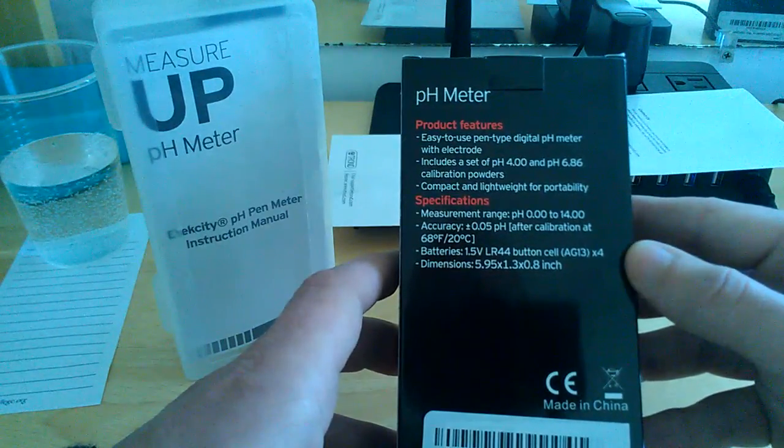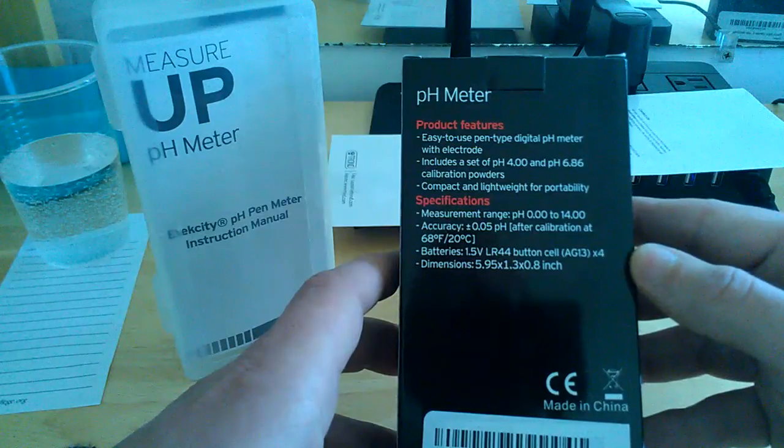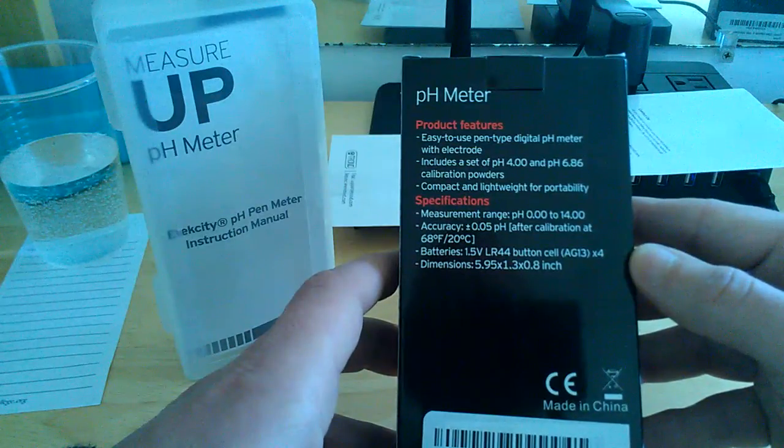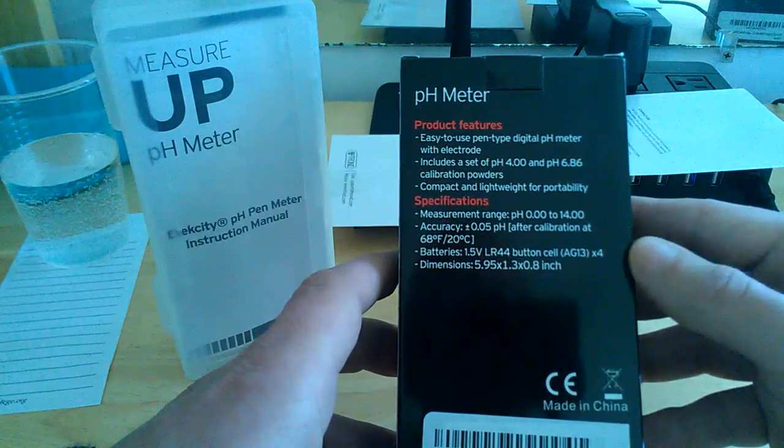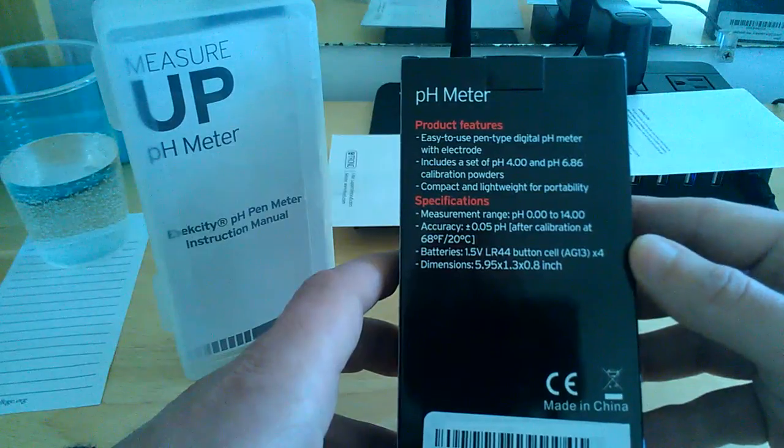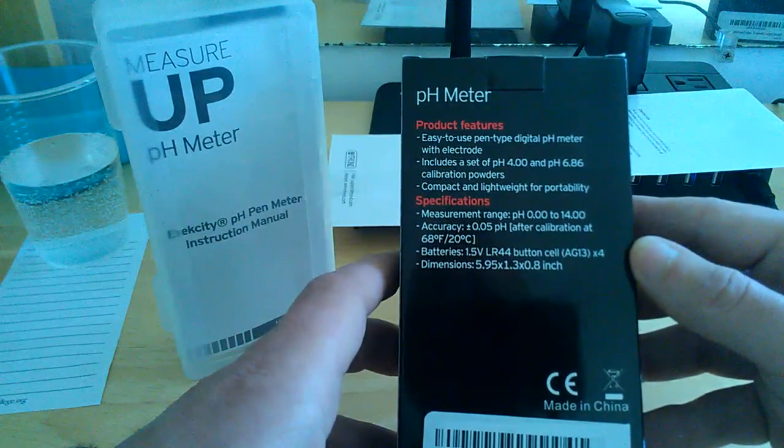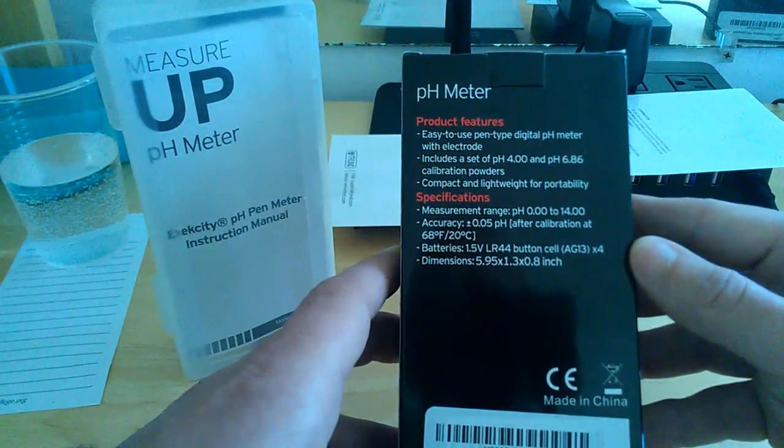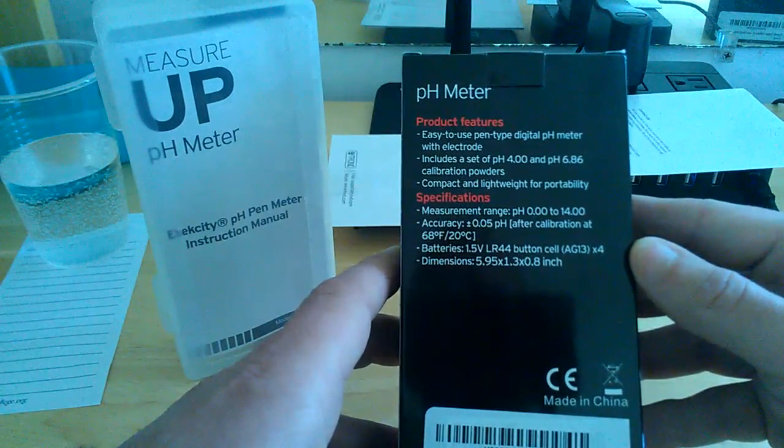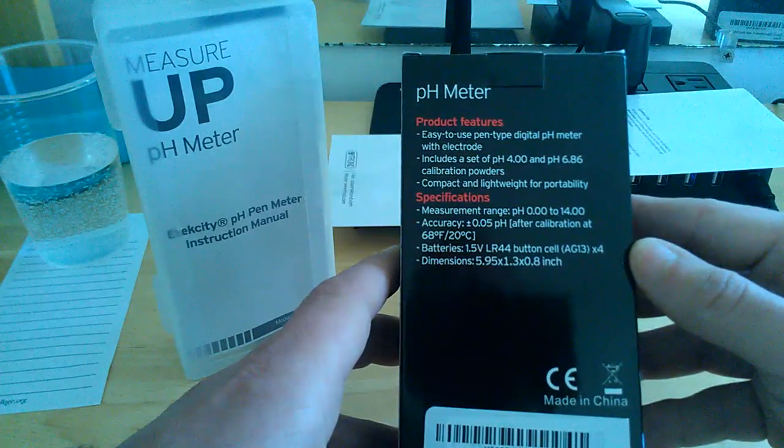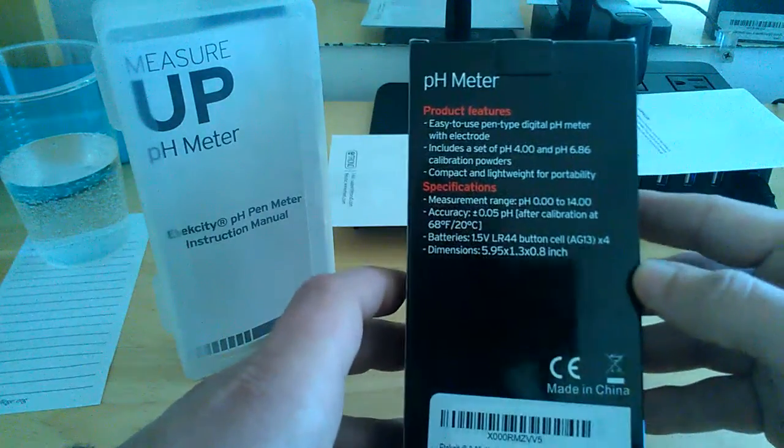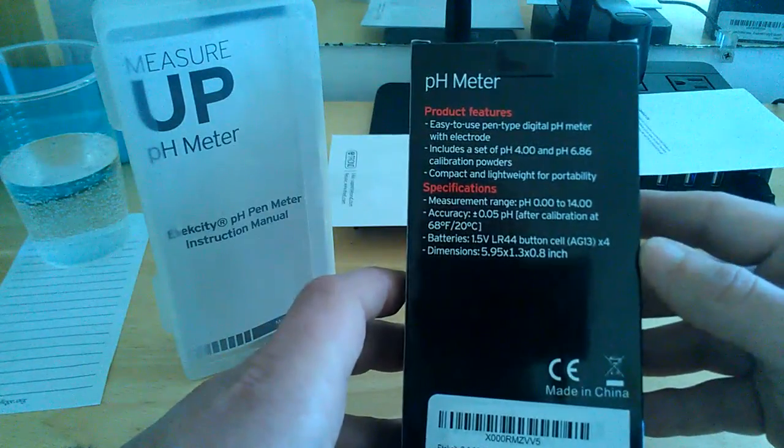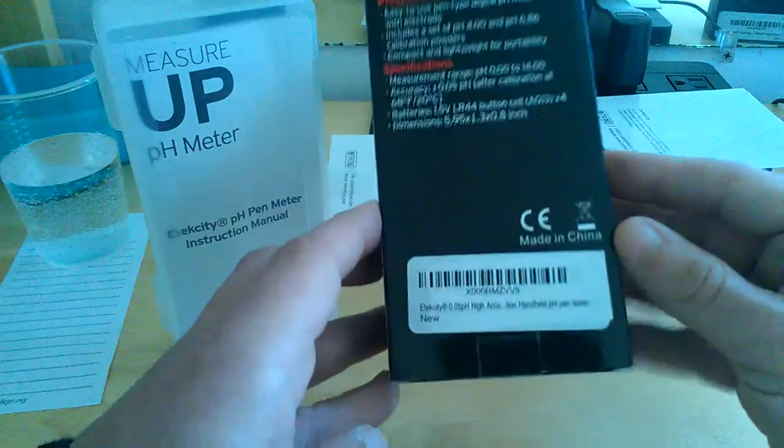Batteries are 1.5 volt LR44 button cells, also known as AG13, and they come included and are already installed in the device for you guys. Dimensions are 5.9 inches by 1.3 by 0.8 inches. That's the actual meter itself. Very compact, very portable.